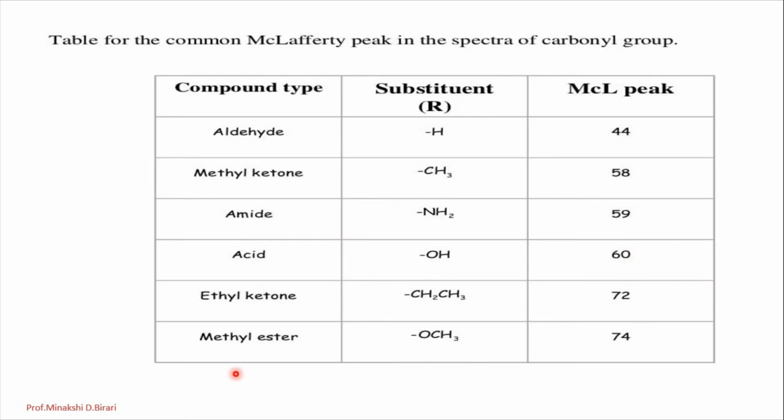So these are the common McLafferty peaks in the spectra of carbonyl groups: aldehyde, methyl ketone, amides, acids, ethyl ketone or methyl esters.